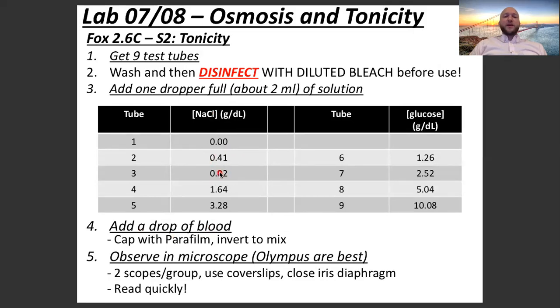Test tube 3, same thing. Drop of blood, mix, put underneath a microscope, and see what the red blood cells look like. We're going to do that for all 9 test tubes.